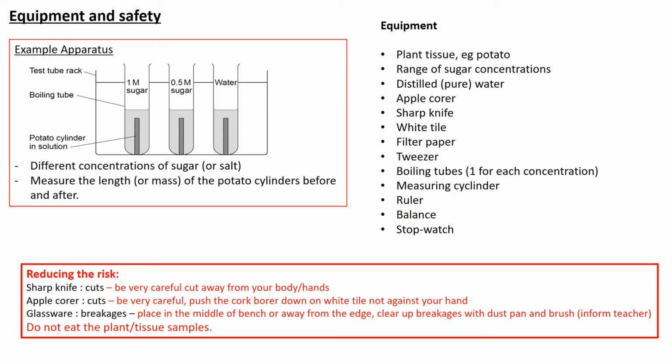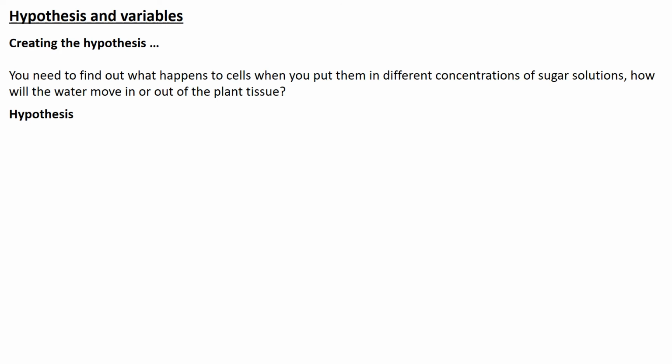So, and just as a precautionary, because I have taught some of you, do not eat the plant tissues. Do not drink the water. Okay, just putting that out there. All right. So, can you just make a note about the risk assessments and sketch yourself a quick diagram? So, hypothesis.